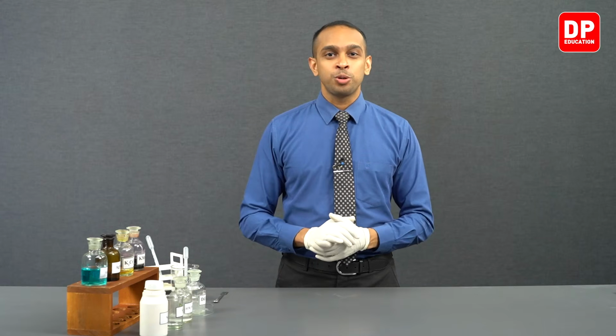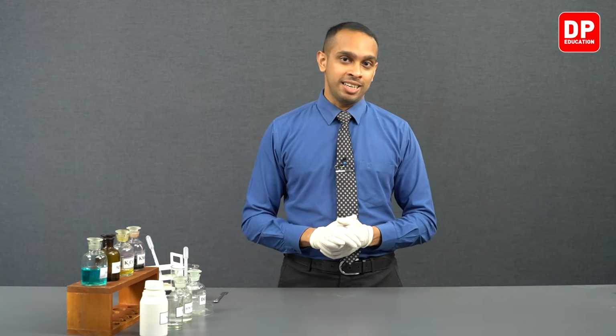Students, let's go through the summary of the identification tests that we carried out for sulfide ions. At the beginning of this experiment, we reacted a sulfide ion solution with silver nitrate and with copper sulfate. We saw when copper 2+ ions come into contact with sulfide ions, it formed copper sulfide, which is a black color water insoluble precipitate. So this reaction can be used to identify the presence of sulfide ions.